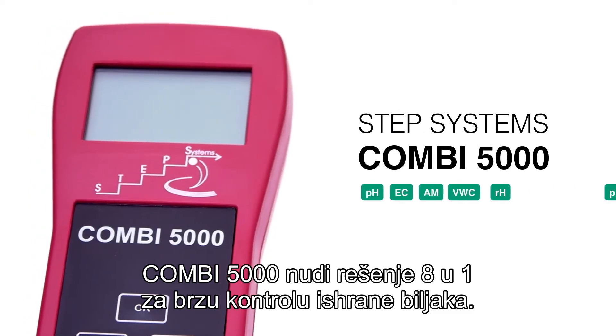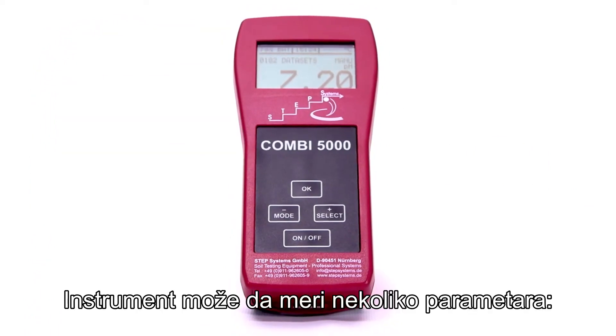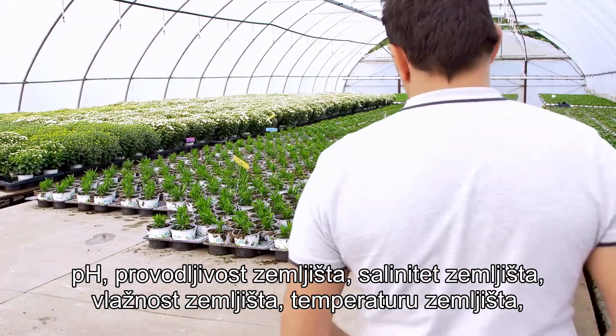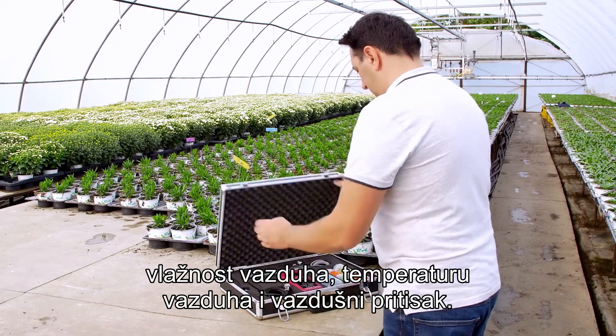The COMBI 5000 offers an 8-in-1 solution for the rapid control of plant nutrition. The instrument can measure several parameters: pH, conductivity, soil salinity, soil moisture, soil temperature, humidity, air temperature, and air pressure.